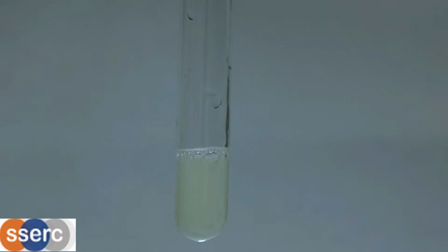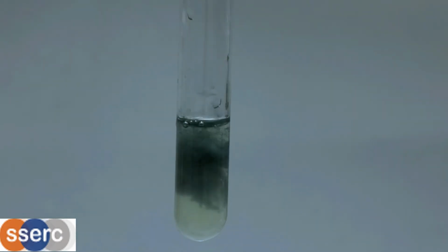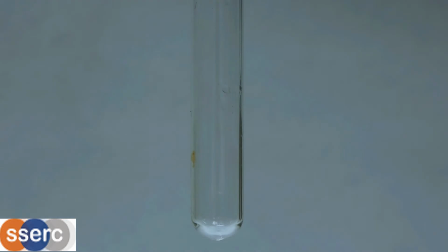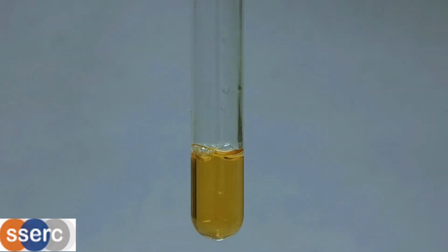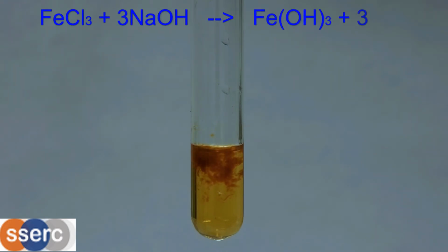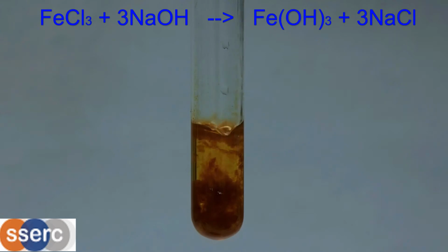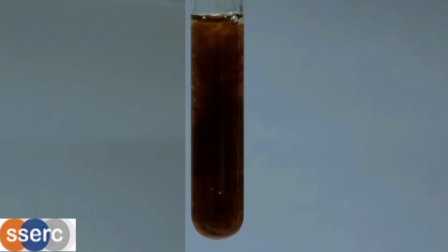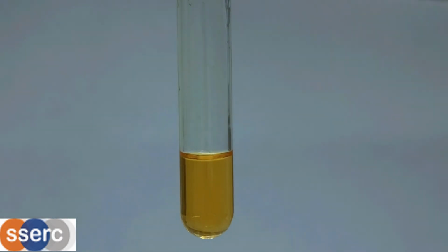With ammonia, unlike copper this time, the reaction is exactly the same as for sodium hydroxide. Dark green iron 2 hydroxide is produced, which doesn't dissolve. Iron 3 compounds produce yellow or orange solutions. This time, sodium hydroxide produces a reddish-brown precipitate of iron 3 hydroxide, which too does not dissolve in excess alkali. And as with iron 2, the effect of ammonia is exactly the same as the sodium hydroxide.